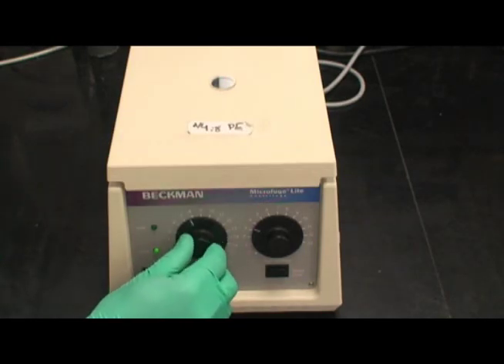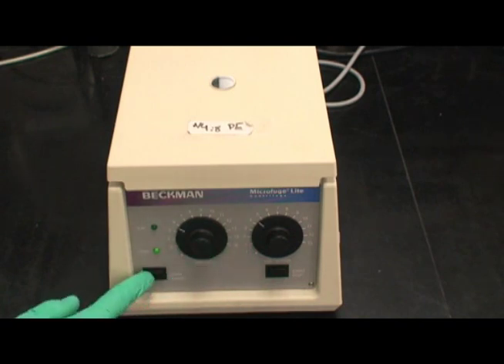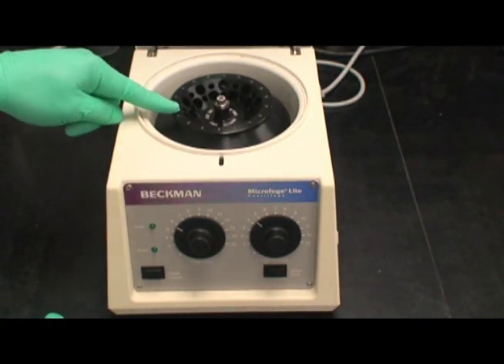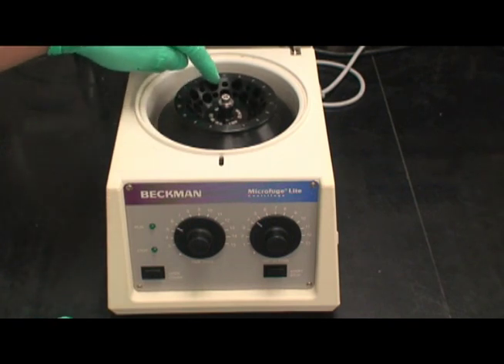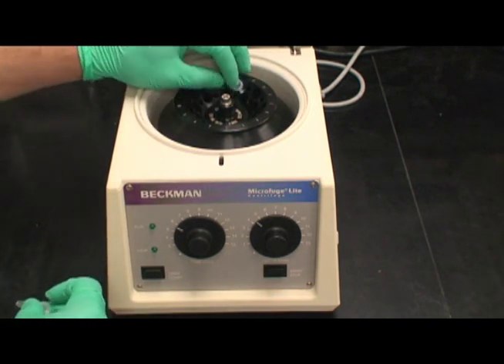This is another example of a microfuge device. Similarly, it has knobs that adjust the time and speed of the centrifugation. A small button in the bottom left opens the lid. This particular rotor has differently sized slots, allowing for tubes of various sizes to be spun at the same time.